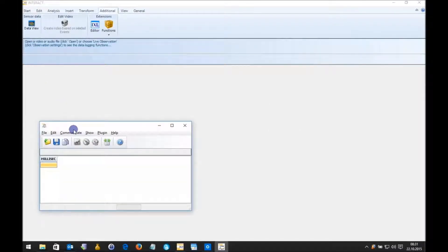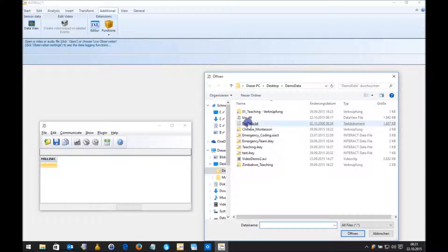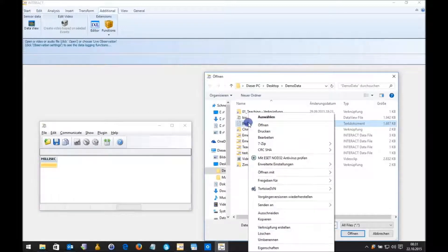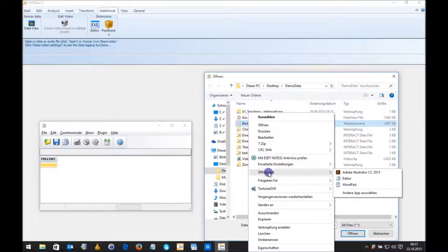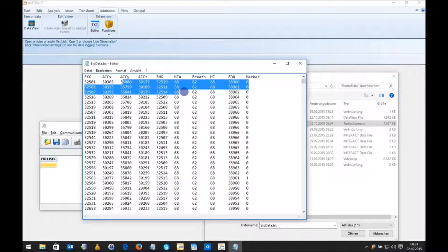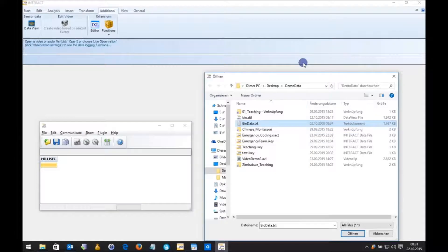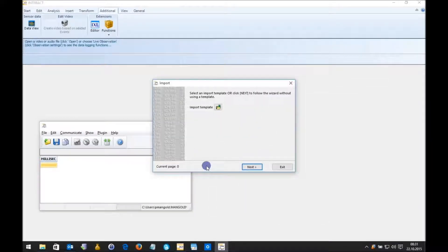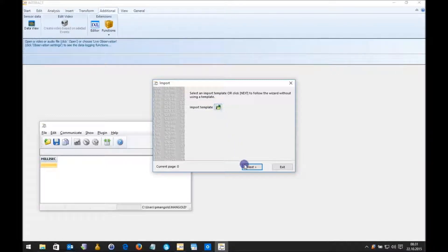What I'm going to do now is open my physiological measurements. I'm going to show you here what data this is. Now this is, as you can see, tab-delimited data in text format. And when I start the import here, Data View tells me this is obviously not a Data View file but a text import. So I can use a predefined template to import it. I don't have one, so this is what I'm going to walk you through here.